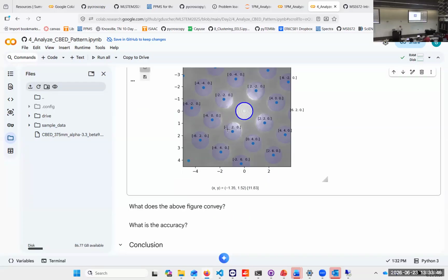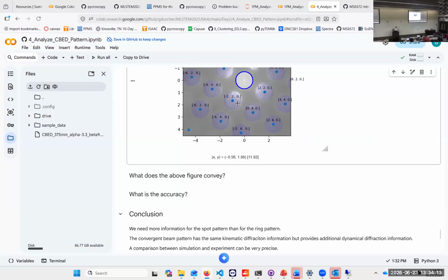We got all the different diffraction spots. So there are no diffraction spots that are forbidden, and can be reached by a double diffraction of the different diffraction spots. If you put a little bit more time onto that, then you can make that very exact, right? Ideally, of course, you would want to do that by having something fine set.